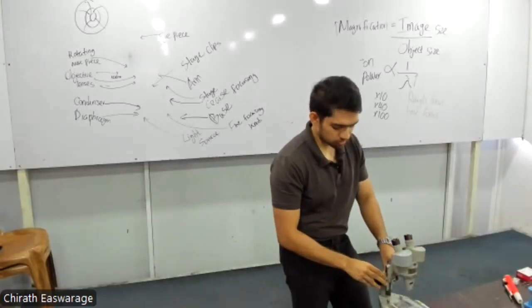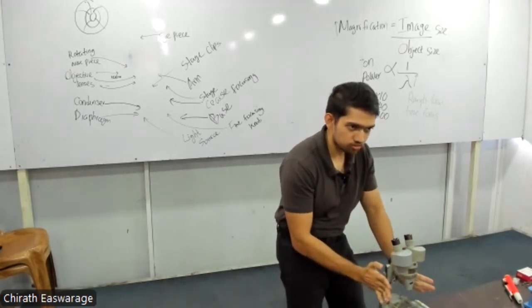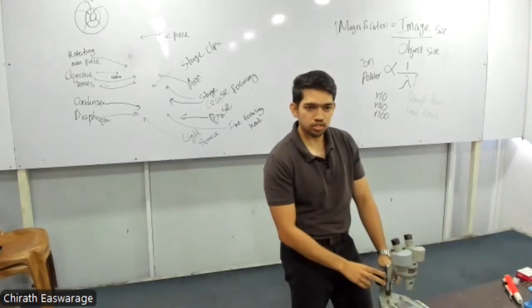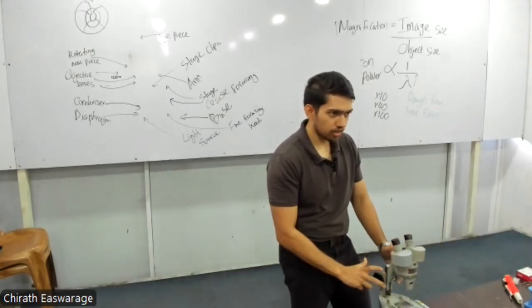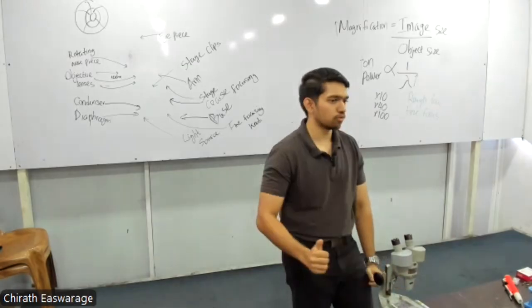So in the exam, actually, the microscopes are locked. The coarse mechanism is locked. Coarse focusing is locked. In the exam, we are not allowed to touch the coarse focusing. We are only allowed to touch the fine focus.